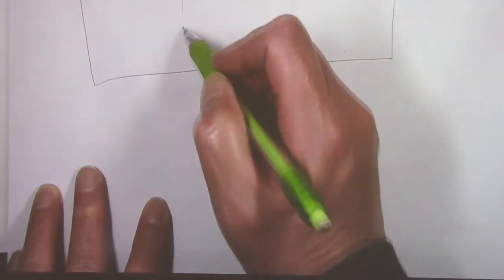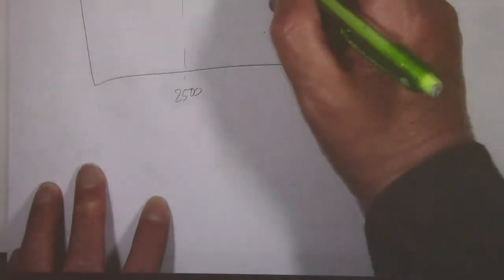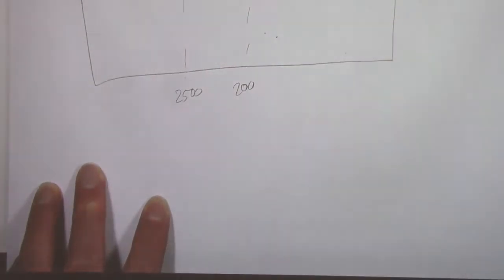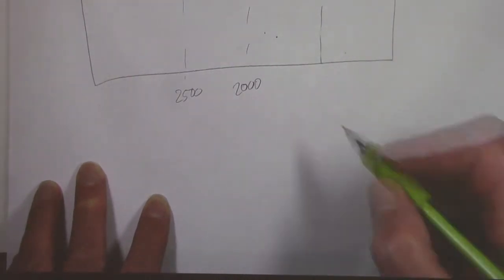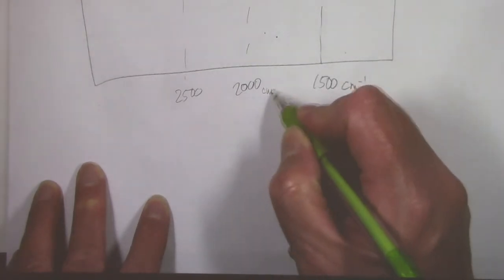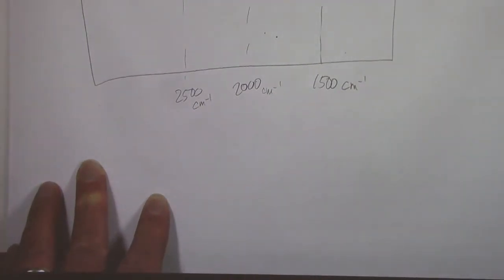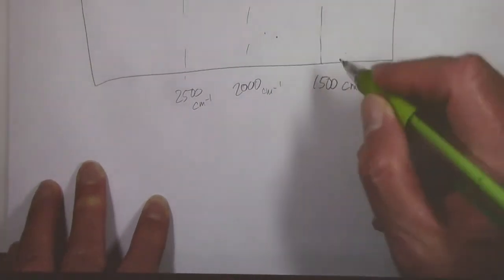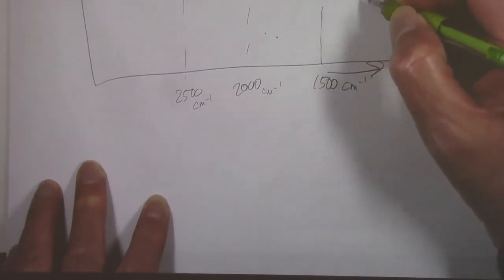that if you have an IR spectrum, I'll put a line here at 2500. I'll put a line here at 2000. And I'll make this 1500, and these are all inverse centimeters. And these are just approximate lines. But this, 1500 and below, is your fingerprint region.